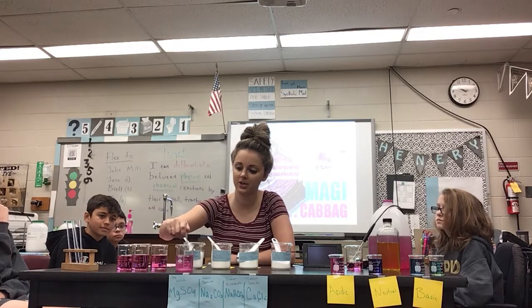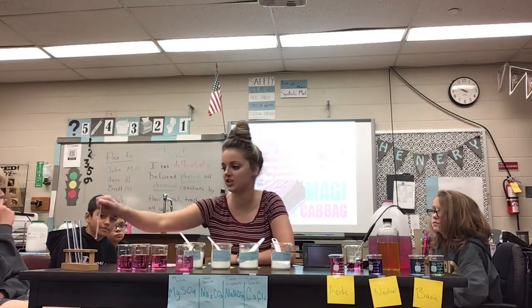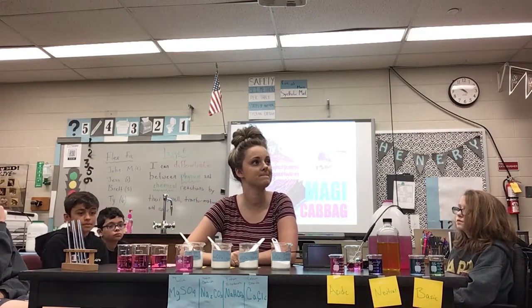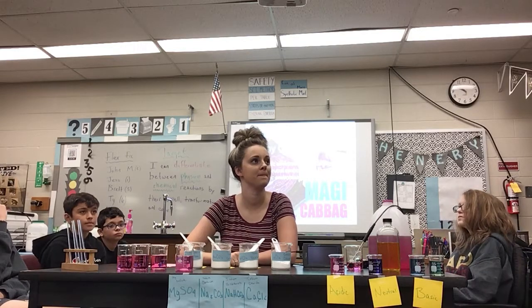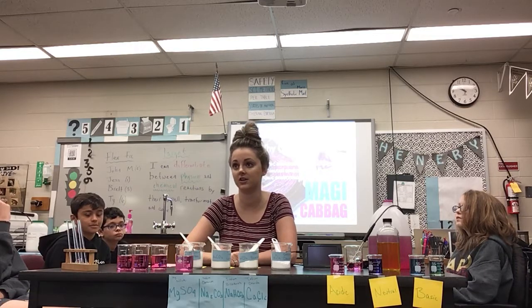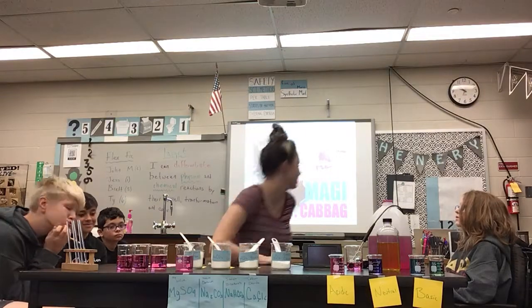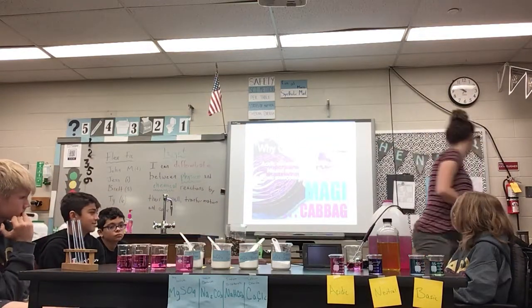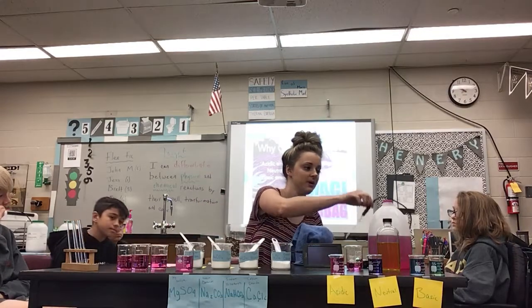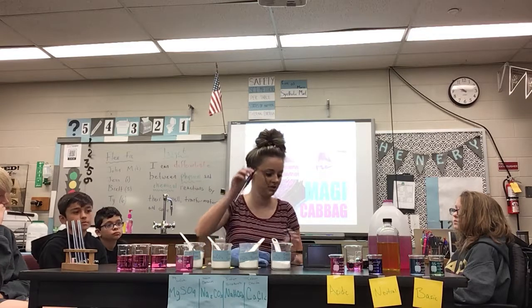Okay, and why is it important after every time I do this that I wash these? Because if you put it with something that maybe isn't as acidic or neutral, it can change it. Perfect, good. Okay, so let's take a look at this. It doesn't look like the color has changed much. I don't want to have multiple chemicals combining.